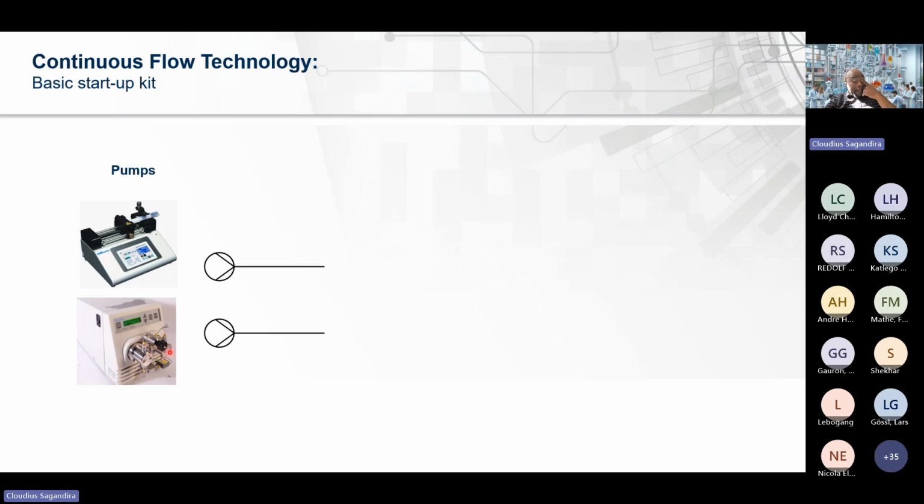Or you can just use an HPLC pump. I know that there are so many HPLC pumps lying around in many people's labs. You can use them to do your reaction. And obviously, you need what we call check valves.